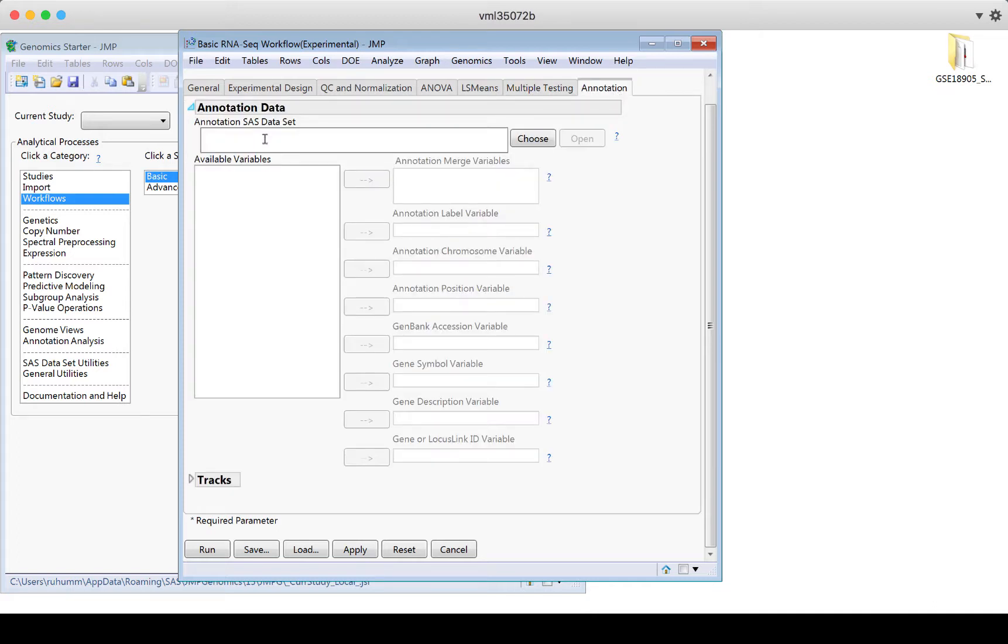If I open this disclosure button, had I another annotation data set, I could choose it here. I've actually already used the annotation when I read in my data. So that experimental design data set includes a lot of annotation information. If I had additional annotation information I wanted to use, I could add that here. And then when I'm ready to run, I can click run.